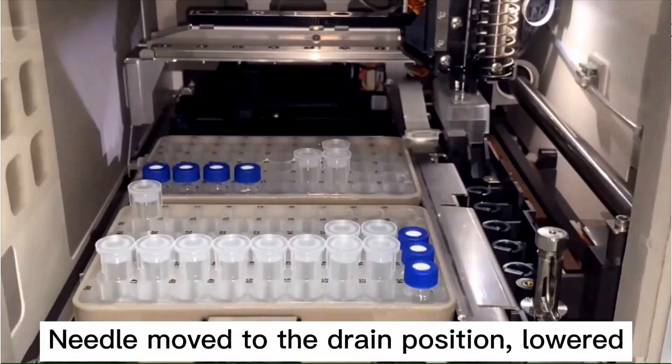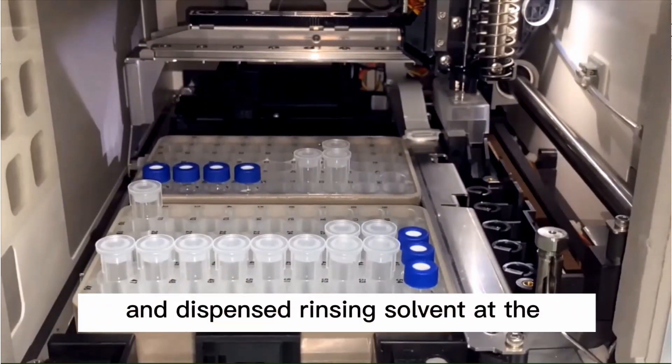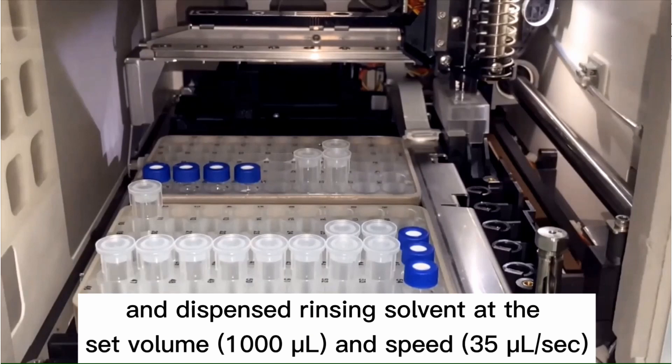The needle moves to the drain and rinse pot for rinsing. The needle moves to the drain position, lowers, and dispenses rinsing solvent at the set volume and speed.